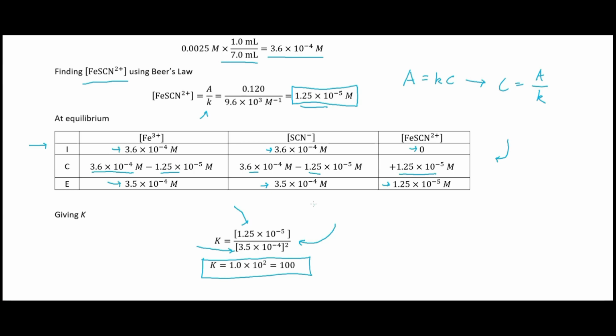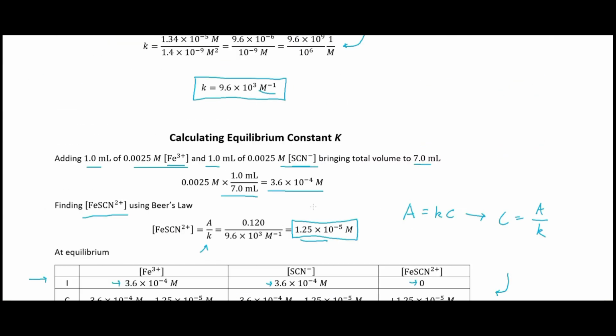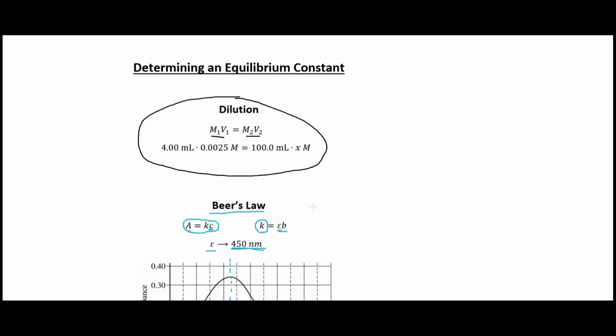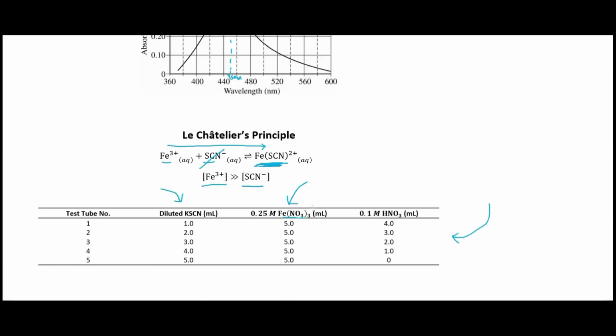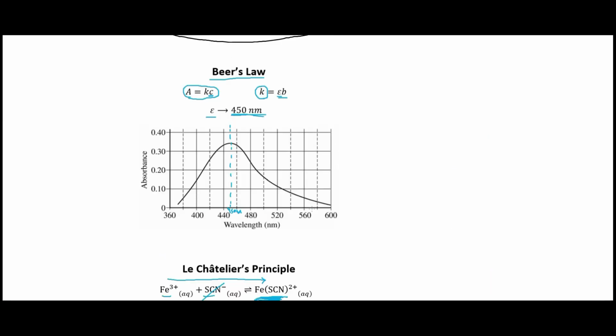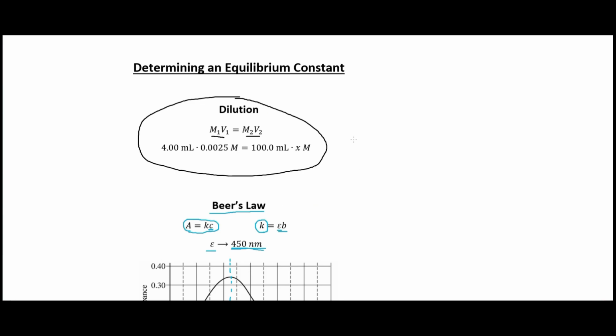But anyway, those are sort of the calculations that we have to do on this lab. This lab is, as you can see, quite heavy on the calculations here, so just be prepared for that. Like I said, one thing that'll help is if you do these dilutions before actually getting to class.